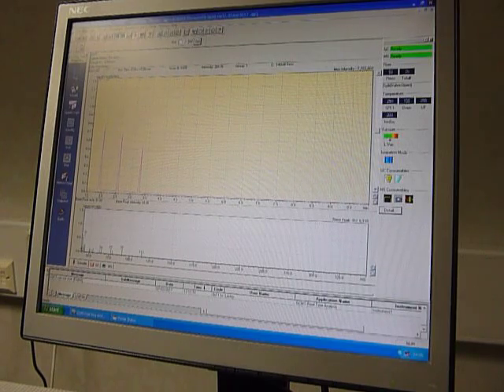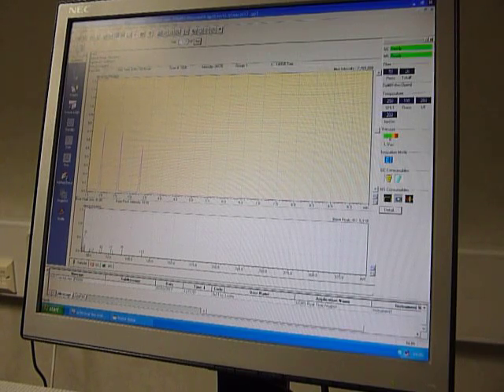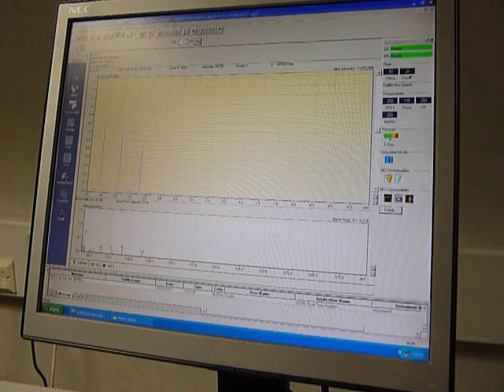We're now going to analyze some decanes by the GC2010 GCMS system. We're looking at tetradecane, that's mass 198; pentadecane, that's mass 212; and hexadecane, that's mass 226 — each differing by one methylene unit.